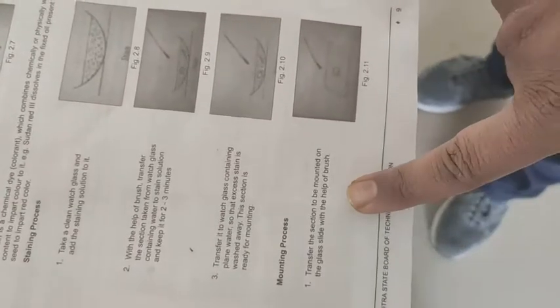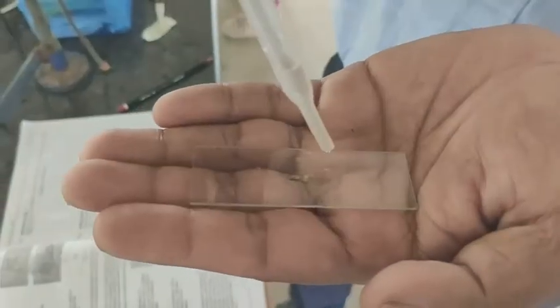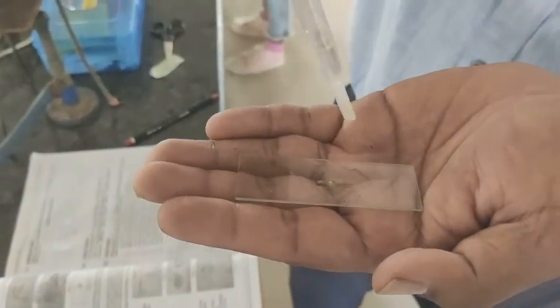In this way you can transfer the section onto the slide with the help of a brush. Then add 1 to 2 drops of water on the section with the help of a dropper. Then place a clean cover slip over the section with the help of forceps and needle.